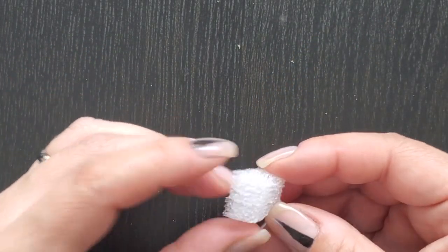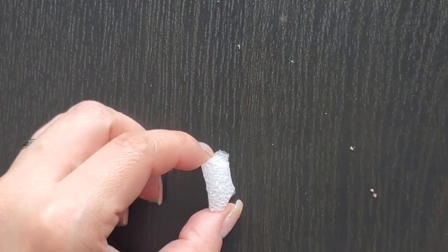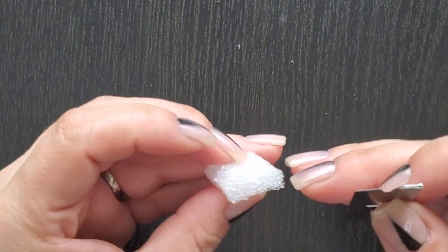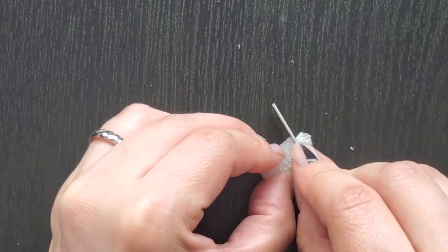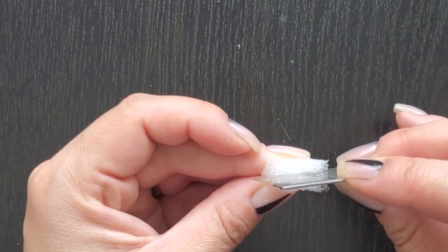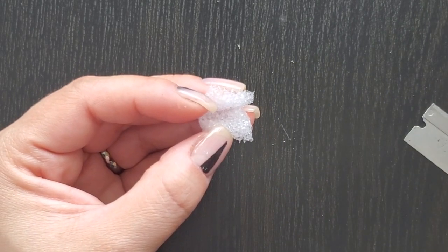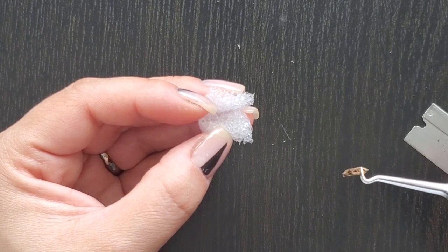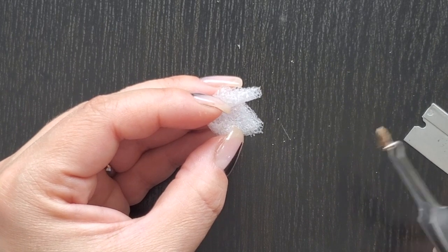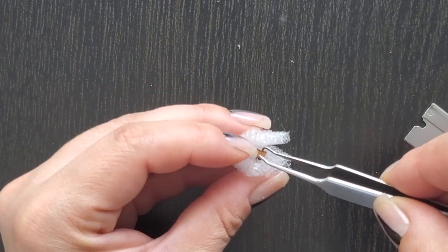So you would grab your Styrofoam. If you have a Styrofoam peanut in those S shapes, you would still cut this so that it becomes a rectangle, and then you want to flatten out the edge because this will be your starting edge, and you're going to cut it open this way, and then it will hold your section inside like so. So let's pretend that this was my gill section that I wanted. You're going to place it in a way where you understand the alignment. So if you can see, these are the gills. You place it inside.